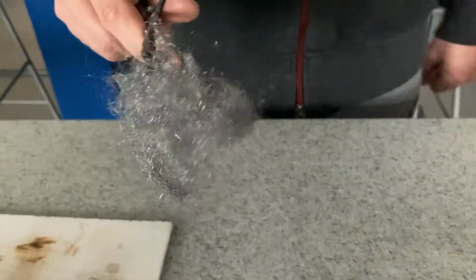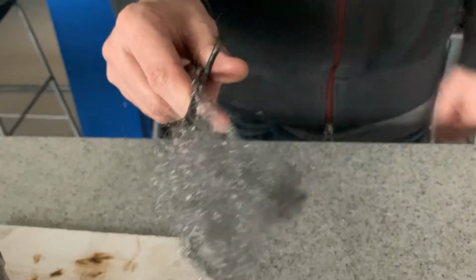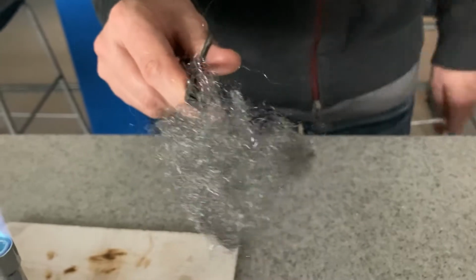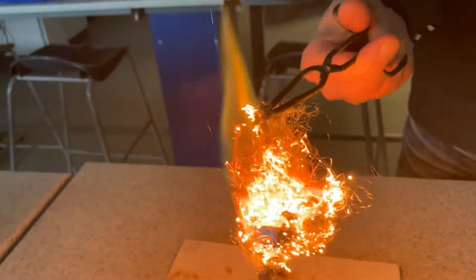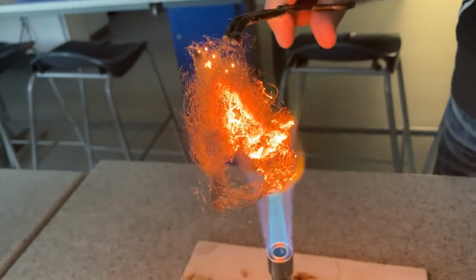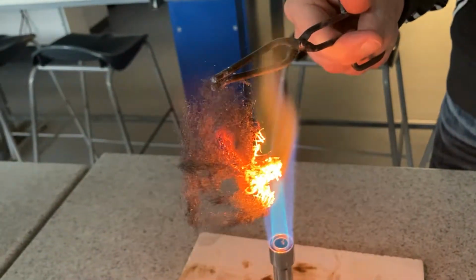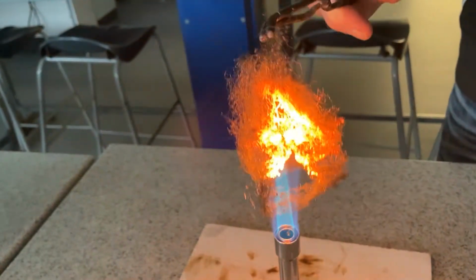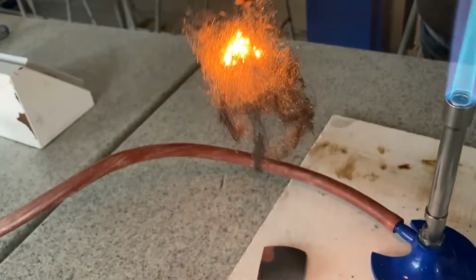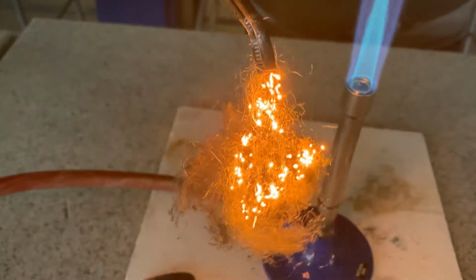Actually, let's try this stuff here. This is also iron, but it's got a much larger surface area. It's called iron wool, and it's just very thin strands of it. It's the same stuff though. Let's have a look. Yeah, that makes a difference, doesn't it? I mean, iron definitely reacts. It definitely forms iron oxide. But to do it, you've got to make it in very thin strands. Not a totally fair test, really. Not a fair test, but we can see it, and it is still reacting, still doing its own thing. Freaky.